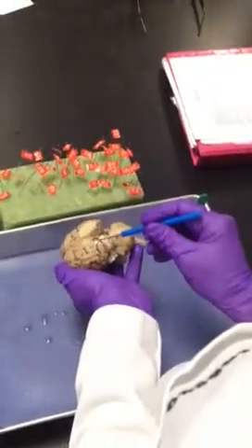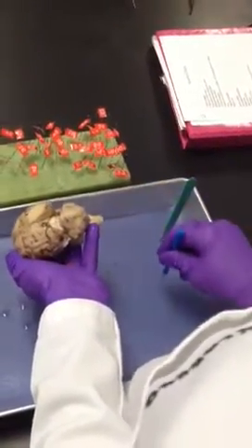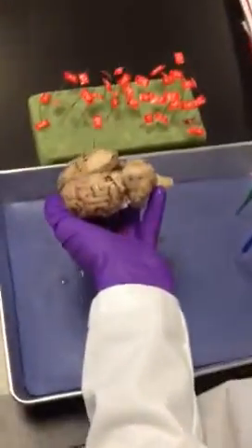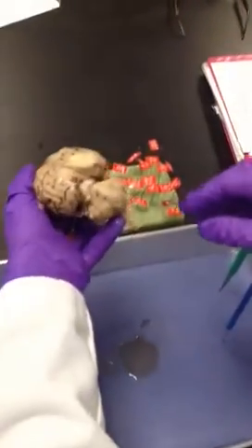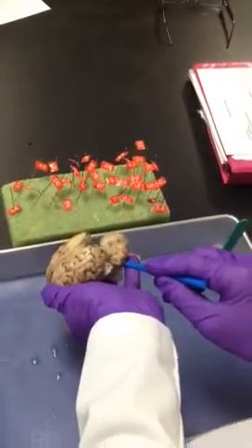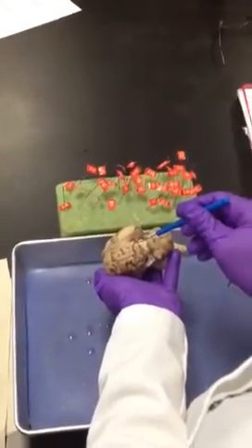So right there is your pineal gland. Some of them it's a little more apparent. So if you had a picture of the anatomy in your brain, you say, okay, I know what I'm going to see when I open that up, and then you look, you go, okay. So there's inferior colliculus down here, superior colliculus on top, and then pineal gland on top of that.